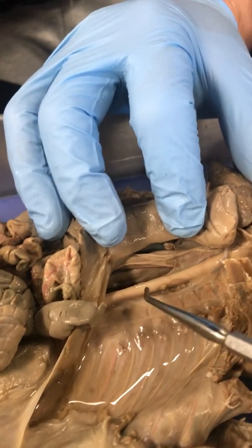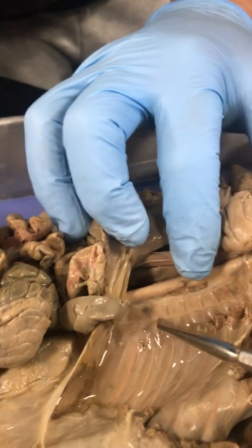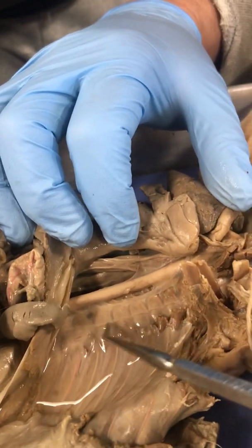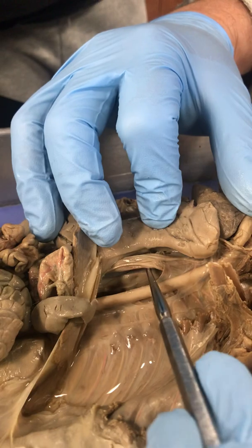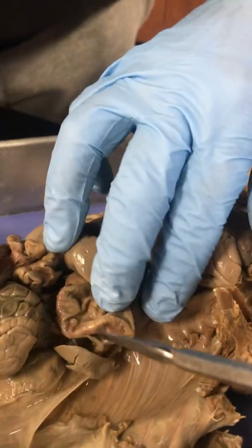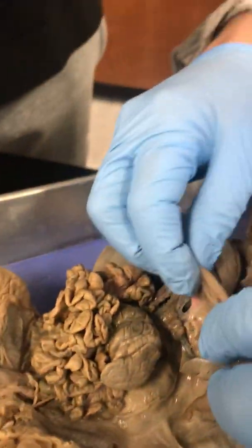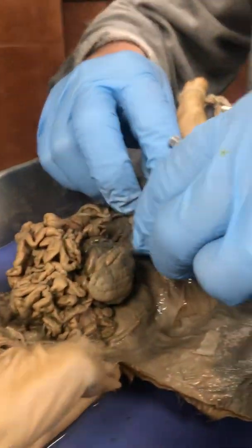Now, in this one, it didn't get well injected. And then that little white thread that you can see lateral to it is the sympathetic chain ganglia, and then you can also see the esophagus here. So there's the esophagus that continues to extend down to the stomach, which would be just inferior to the diaphragm. So that big sac-like structure is the stomach.